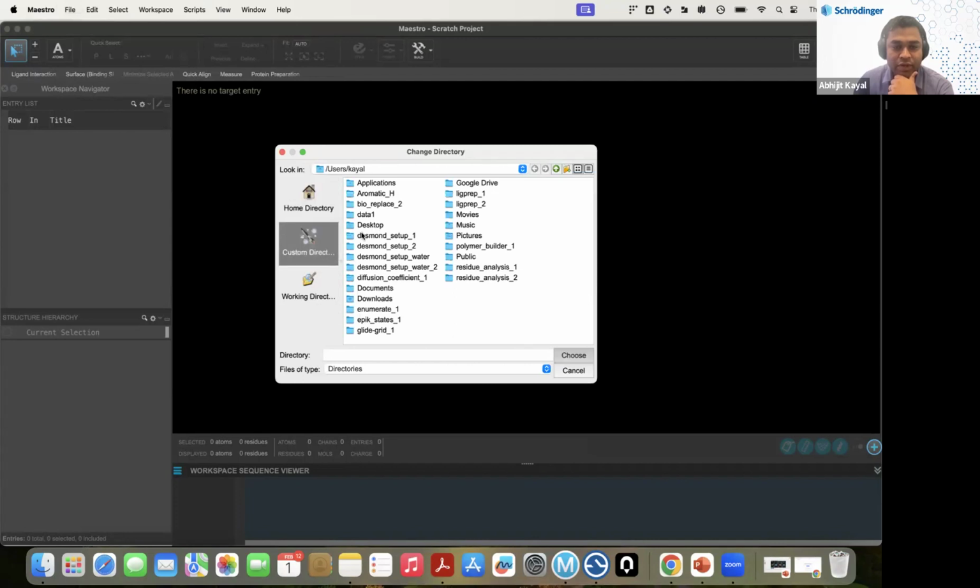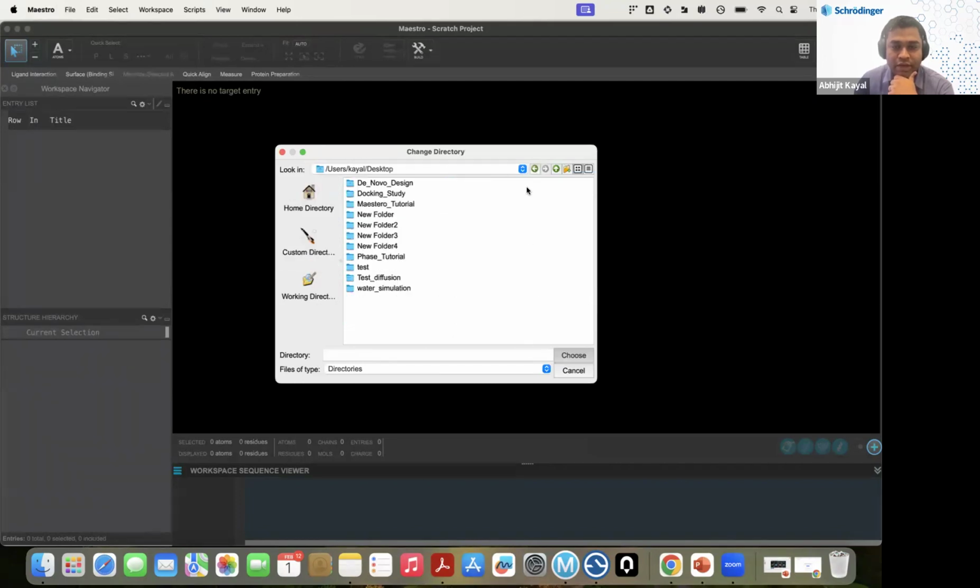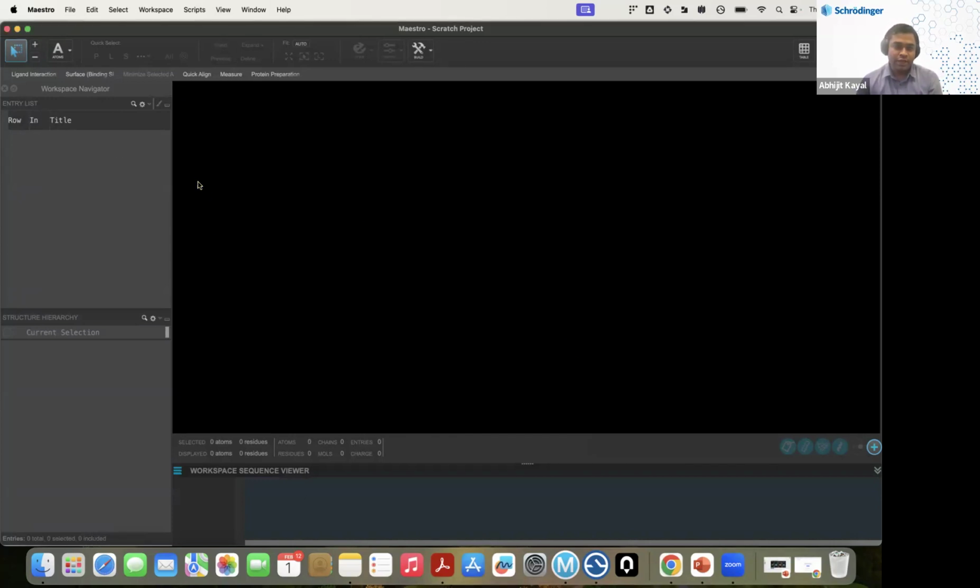I'll go to desktop, and I'll create a new folder. I'll give it the name Maestro demonstration. And this will be my current working directory. So whatever work I do will be saved there, and I don't need to search again for where I saved it.